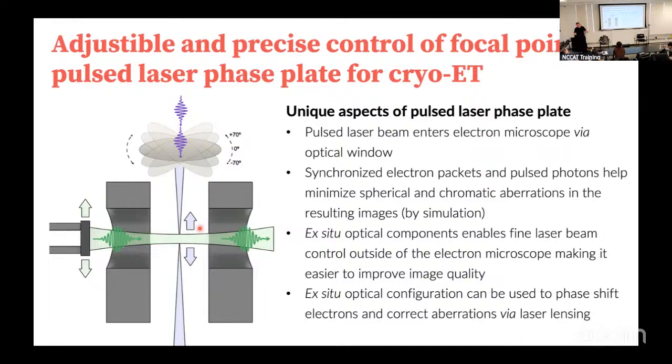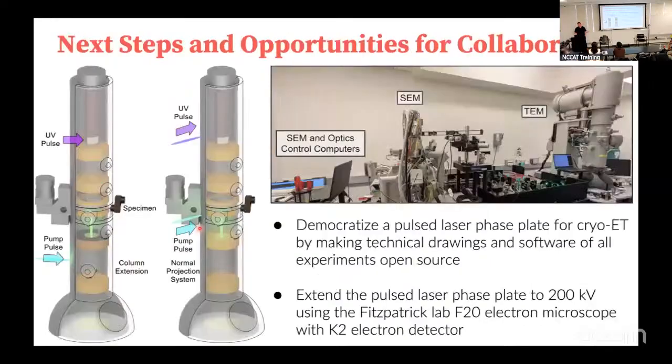And then the final thing, and we're going to end on this pretty much, is that all those other lensing effects that you can have in a microscope are pretty well controlled by magnetic lenses. But things like aberration correction and so on, there is increasing evidence that you could use lasers for little tweaks like that, because they're a scalpel. They are a way of doing this in a very fine way.